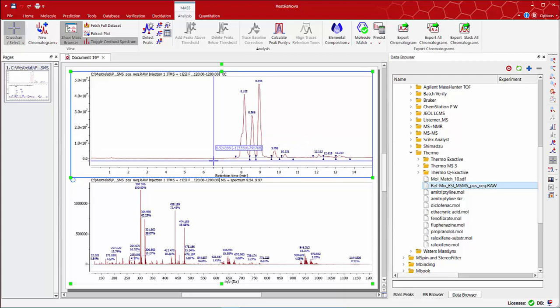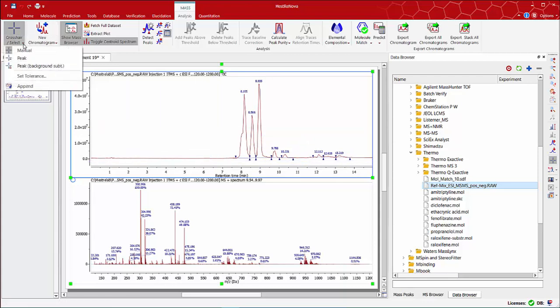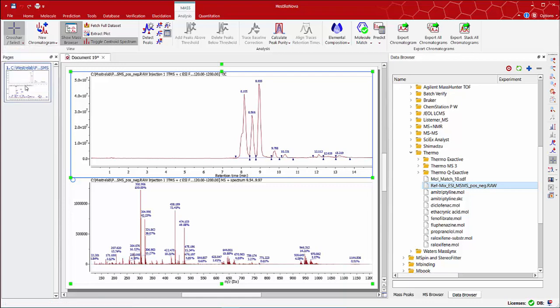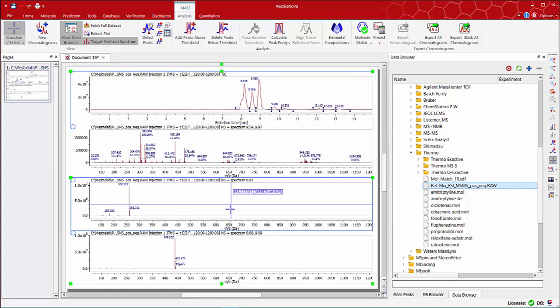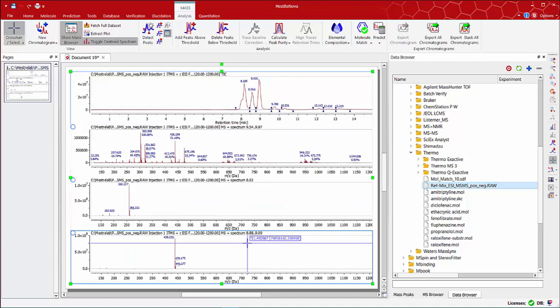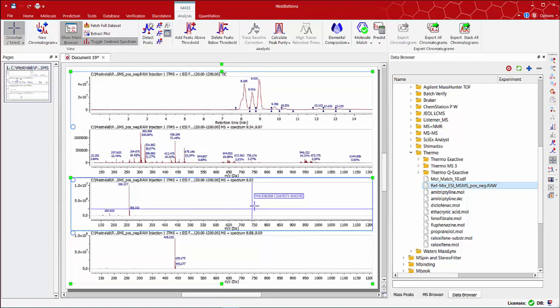If you want to display multiple mass spectra then go to the crosshair tool and select append mode. In this case you click on any point of your TIC data. All mass spectra plots will be shown on the screen.